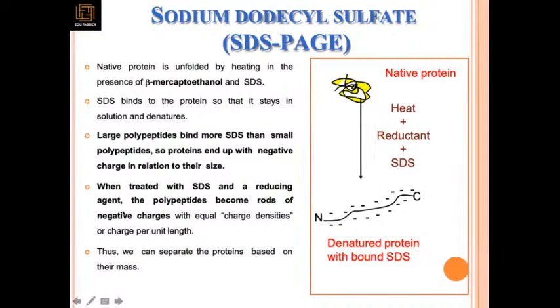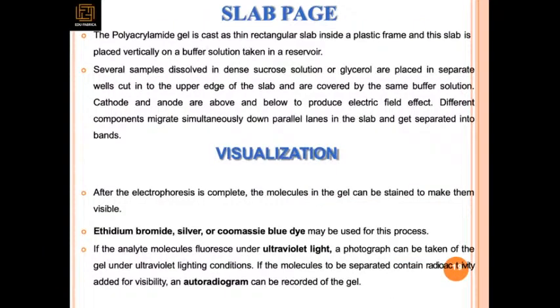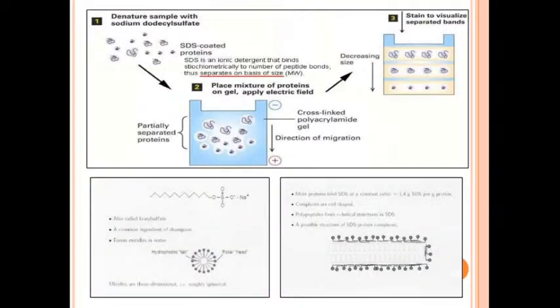So, bachche, SDS page, all these things, I am mainly teaching you because you will have some content for your examinations. So, please go through them. This is the main animation that is showing that according to your decreasing size, your separation is done in this case.